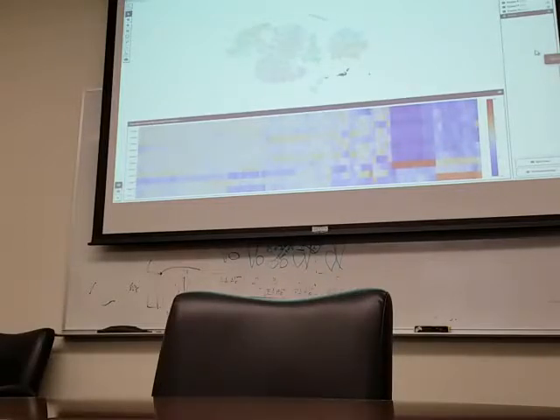We keep asking this, and I ask too: if you get rid of those clusters, are those clusters influencing the plot? Definitely they are.